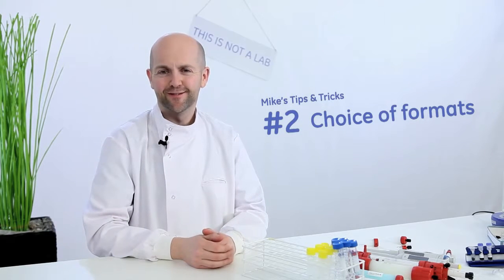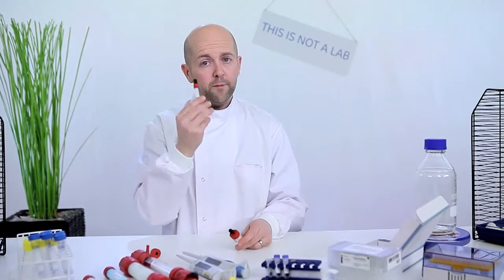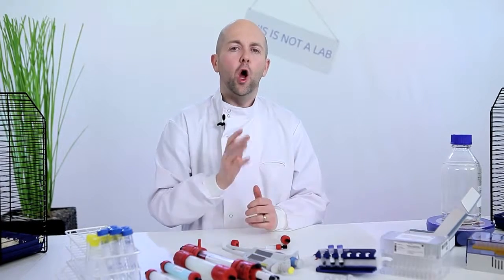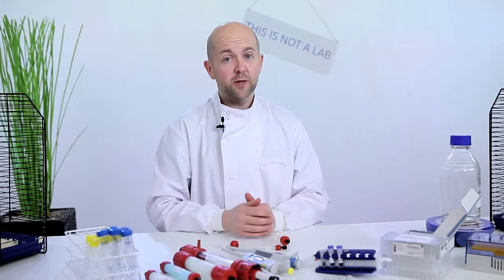Mike's second tip, choosing the right format for the job. HiTrap protein AHP and HiTrap protein GHP are ideal columns for lab-scale purification and are designed to give maximum purity and yield. They are supplied in both 1 ml and 5 ml column formats. Scale up is easy. Just stack 2 or more columns together, just like that. This very flexible and convenient format can be used with a syringe, a simple pump, or a system. You choose. Remember, only purify identical samples in the same column. Different samples result in cross-contamination.